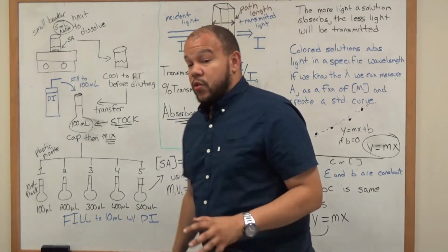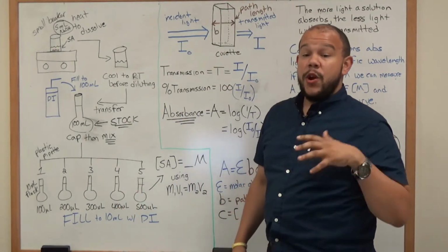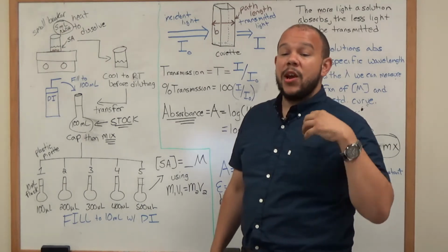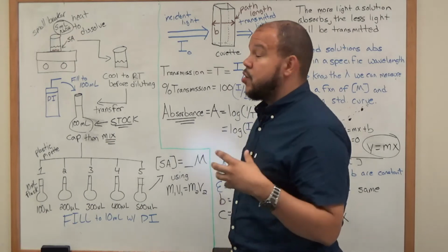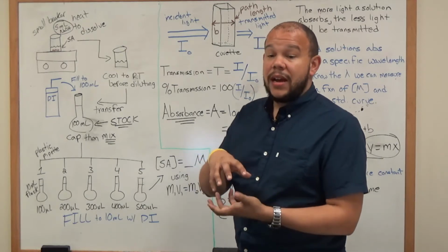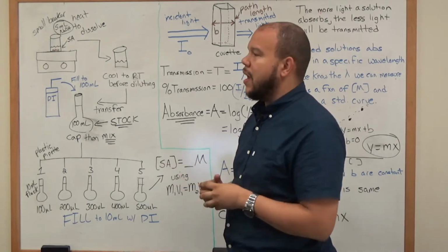So from a procedural standpoint, we are going to be introducing and using some glassware that we are not familiar with necessarily just yet. We've talked about it. We may have seen some pictures of it, but we will actually be incorporating some new glassware. If you read the procedure very quickly, the procedure says to take salicylic acid. The chemical in the stock container is reagent grade salicylic acid.